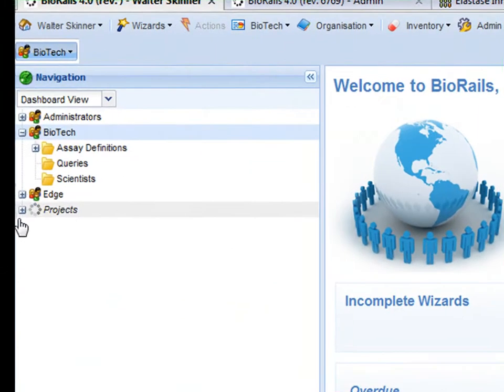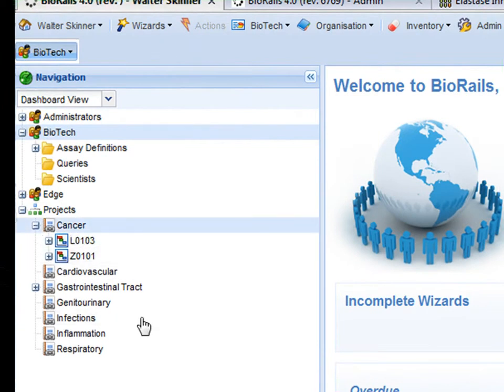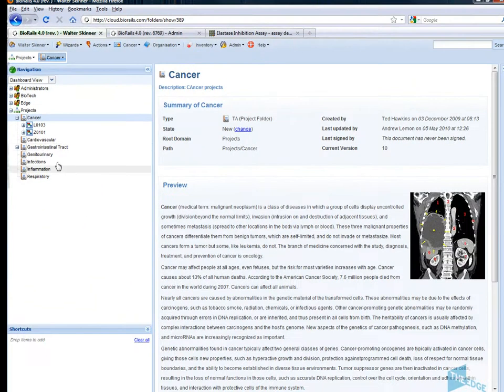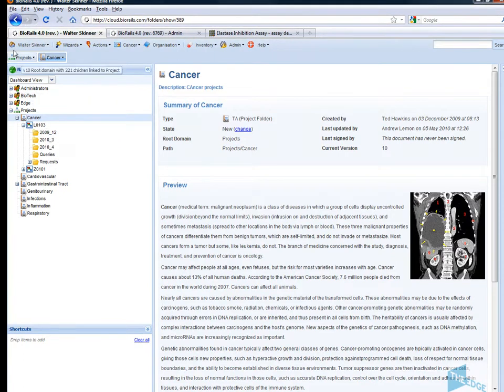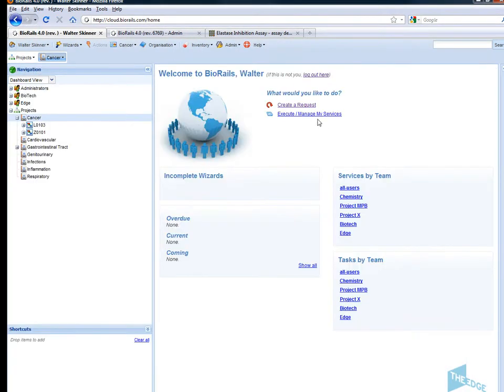I'm working in one of these drug discovery projects. In this case I'm working under the cancer therapeutic area and I'm working on the project L0103. First thing I'm going to do is create a request.